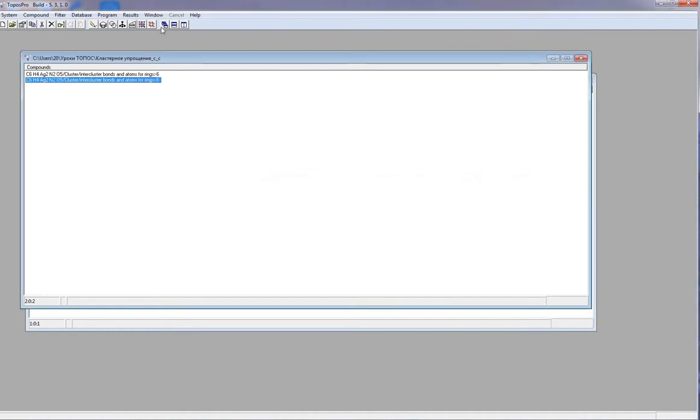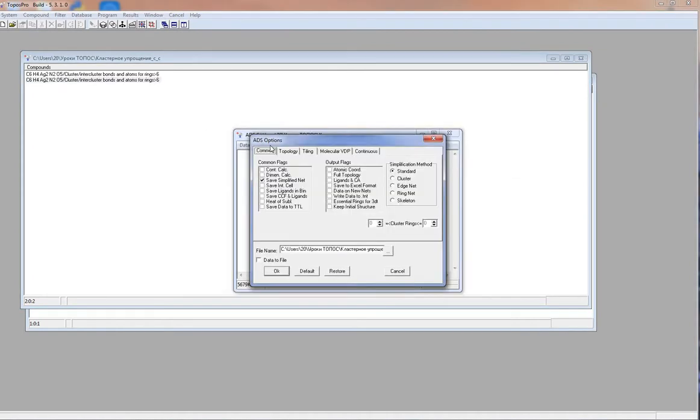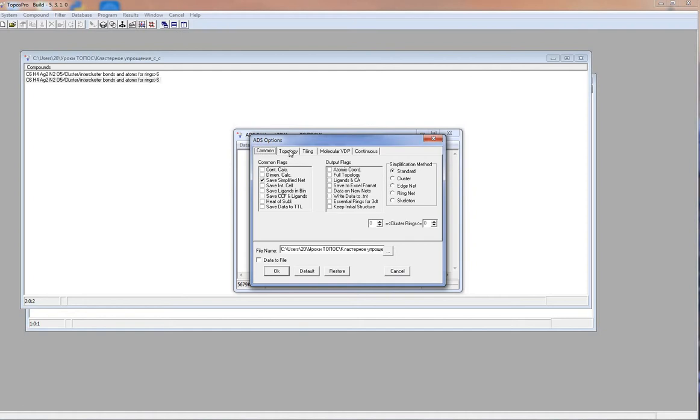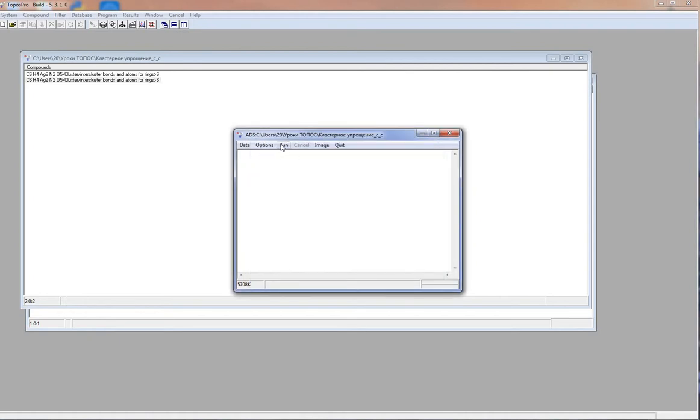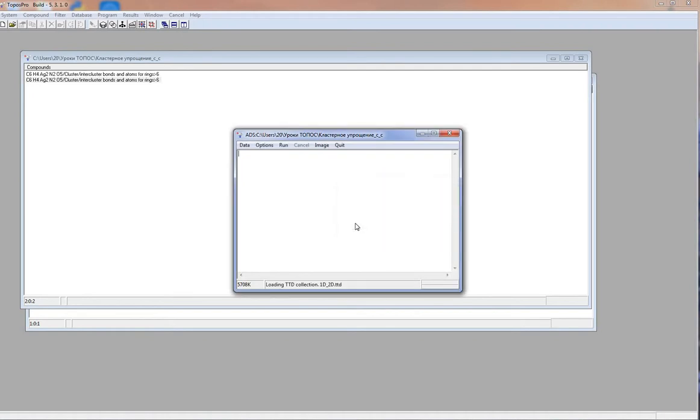I click ADS, options, topology, default. This button sets the options for classification on the underlying net of the crystal structure. Topos offers to load the TTD collection, which is necessary for classification. Now we can see the topological type of structure. It has BCU topology.